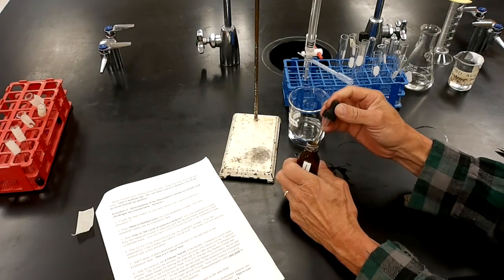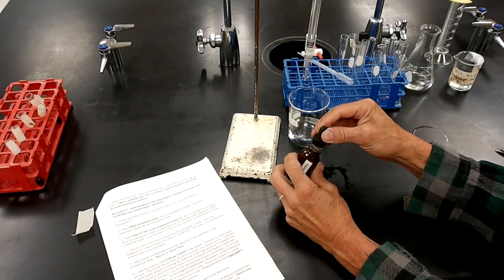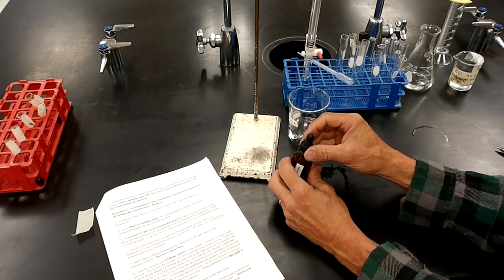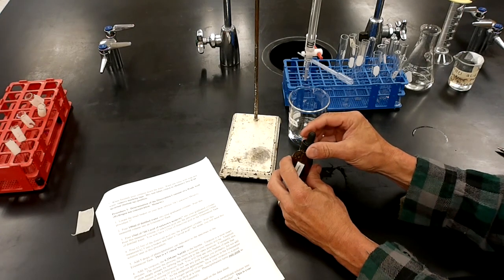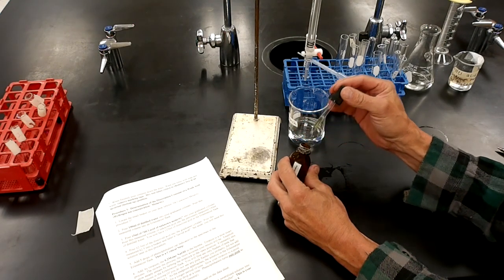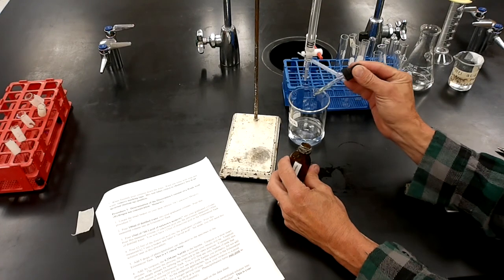Now this solution here, this is another color indicator. This is phenolphthalein. You'll notice it's nearly transparent, slight yellow color to it. What this will do is when the pH goes from acidic, below 7, when it hits 7, this stuff will turn a fluorescent sort of pinkish color, very obvious. So I'll put this in. The instructions call for 5 drops. 1, 2, 3, 4, 5.